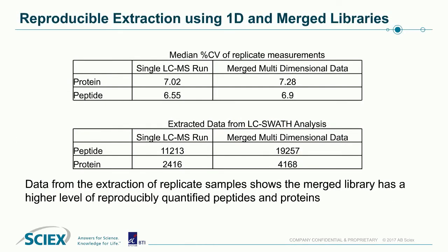When we take this library and use it for quantitative measurements, using a cellular extract from the non-producing strains that we have available, we're able to identify, using the merged library, around 4,200 proteins in that sample, and we're able to get percentage CV measurements on these proteins of less than 10%. In this comparison, we're showing a single LC-MS run to say that the merged library is actually better, so we're able to identify more proteins using this SWATH analysis technique than we can using the single LC-MS run.